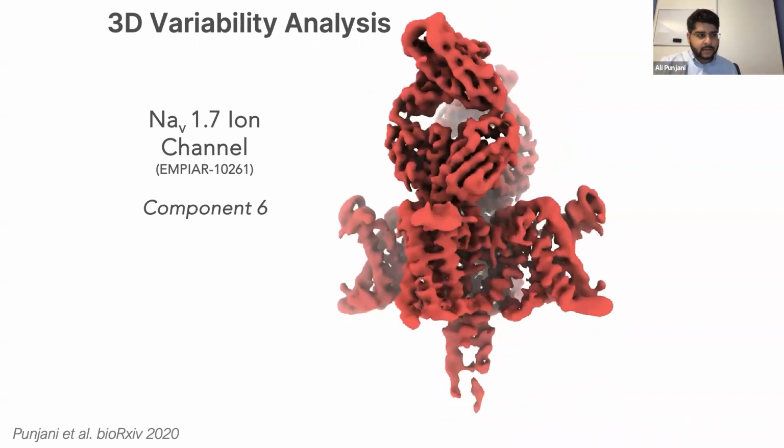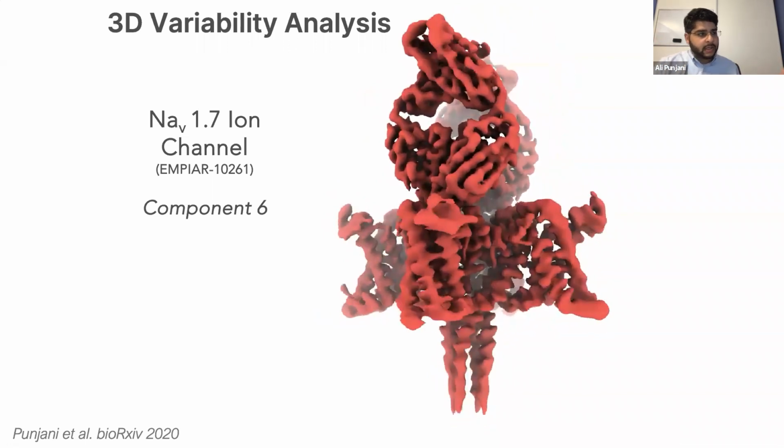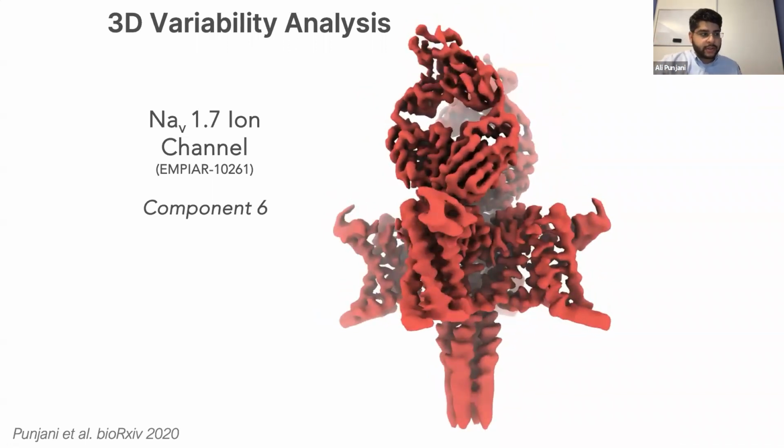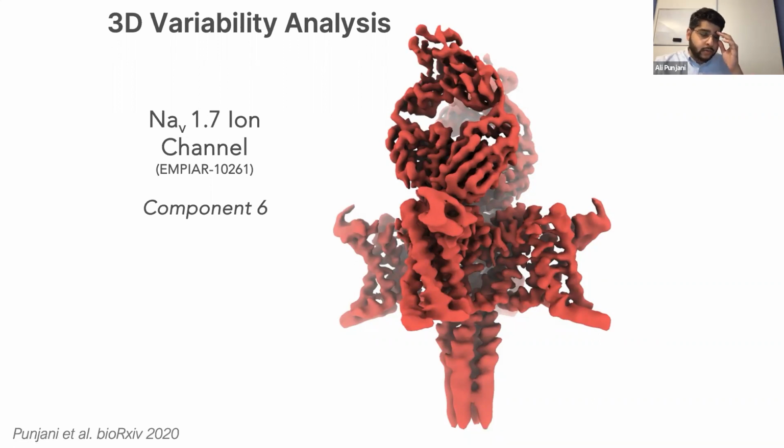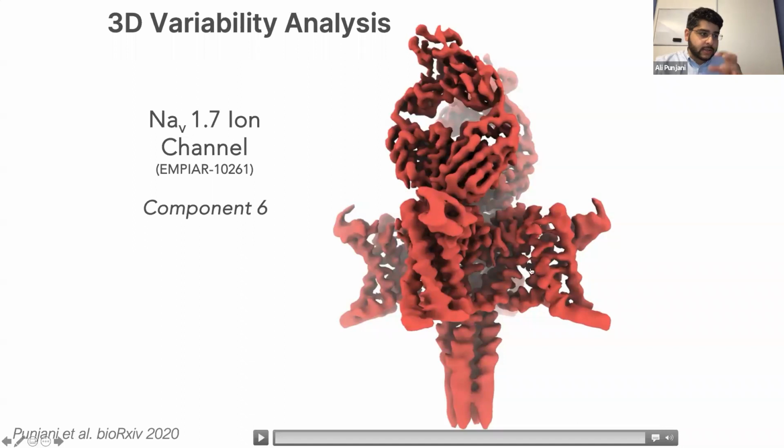Now, this is exactly the kind of result that on a larger protein would suggest to us that we should start trying to do local refinement by creating a mask that includes only the part of the structure that's moving. The trouble with that, of course, is that local refinements and multi-body refinements can only work when the amount of electron density, the amount of matter inside each of the masks, is very large, like 150 kilodaltons or more. So a fragment of a protein so tiny, we can't potentially independently align with other techniques. 3D variability is the first method that can show us the motion of these very small detailed parts of proteins.